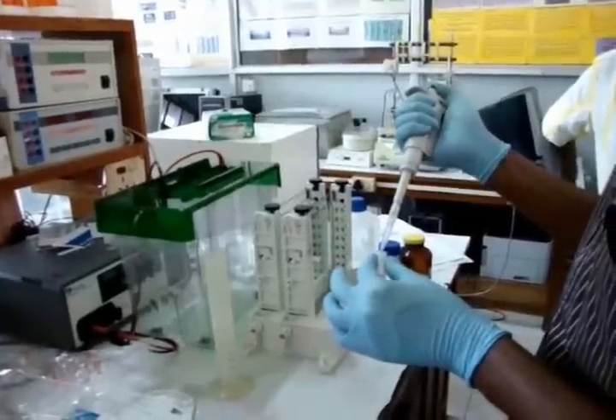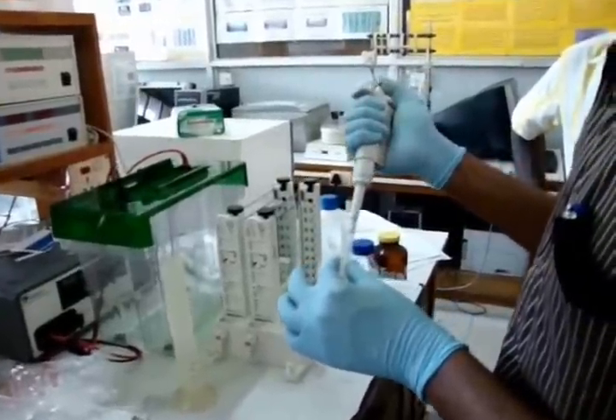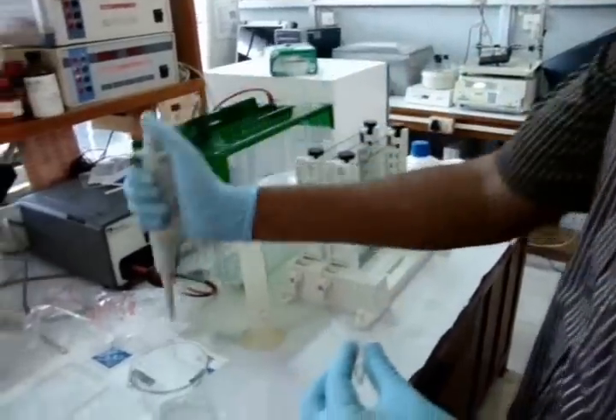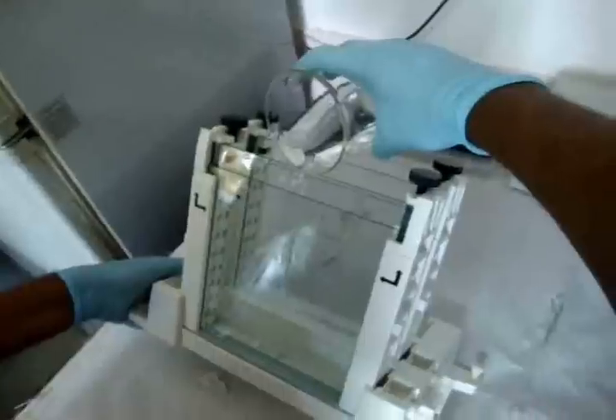Once the protein samples have entered the separating gel, the negatively charged protein-SDS complex continues to move towards the anode. When they move through the gel, they are resolved according to their molecular weight due to the molecular sieving properties of the gel. The steps involved are: selection of gel percentage, selection of gel thickness, preparation of gel solution, equilibration of the IPG strips, and electrophoresis.